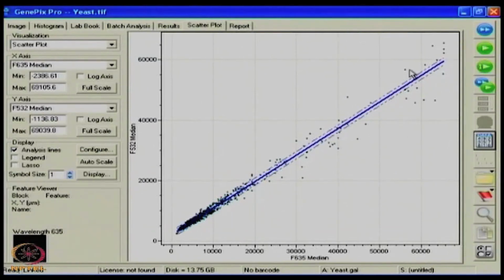The essential rule is that microarray assumes all the chips have spots and genes which are not varying too much. So you expect most of them to stand near the origin, the center. This is what you want to look at: how closely they are aligned determines good data. They should not be too far away from each other, because you expect a few differences but not very significant ones seen at very large scales.